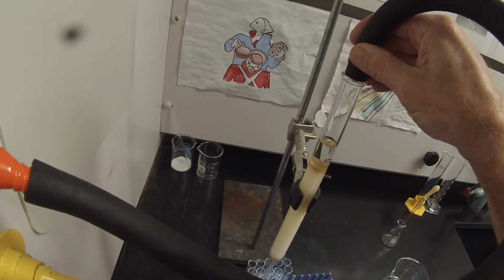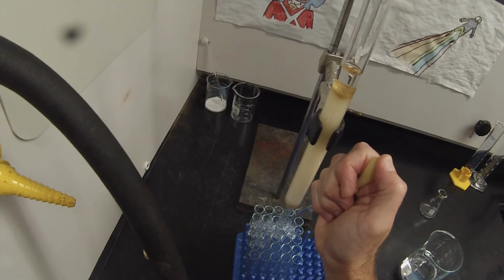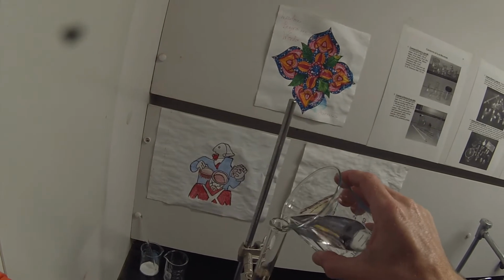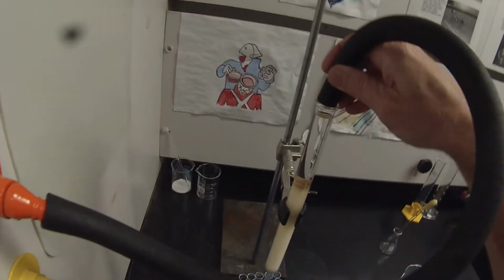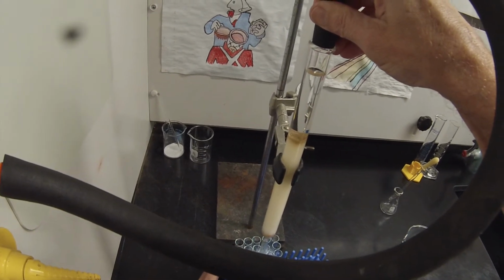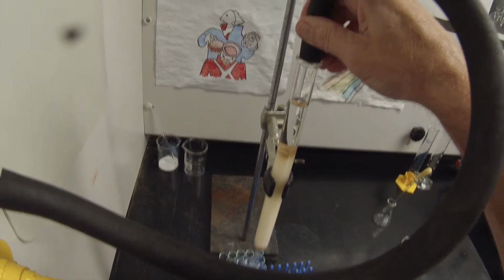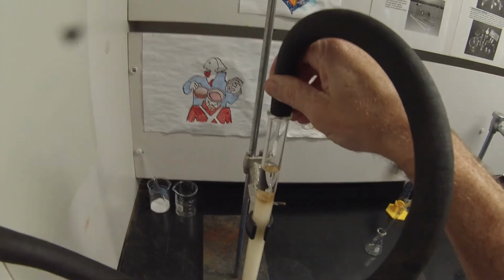And hopefully it's pure vanillin and no cinnamic acid. So I'm going to actually start collecting slightly smaller fractions now, and occasionally rinsing that down to make sure that that solid goes with its proper tube. And what we're hoping is that the vanillin comes off before the cinnamic acid starts, right? The last of the vanillin comes through the column before the first of the cinnamic acid.